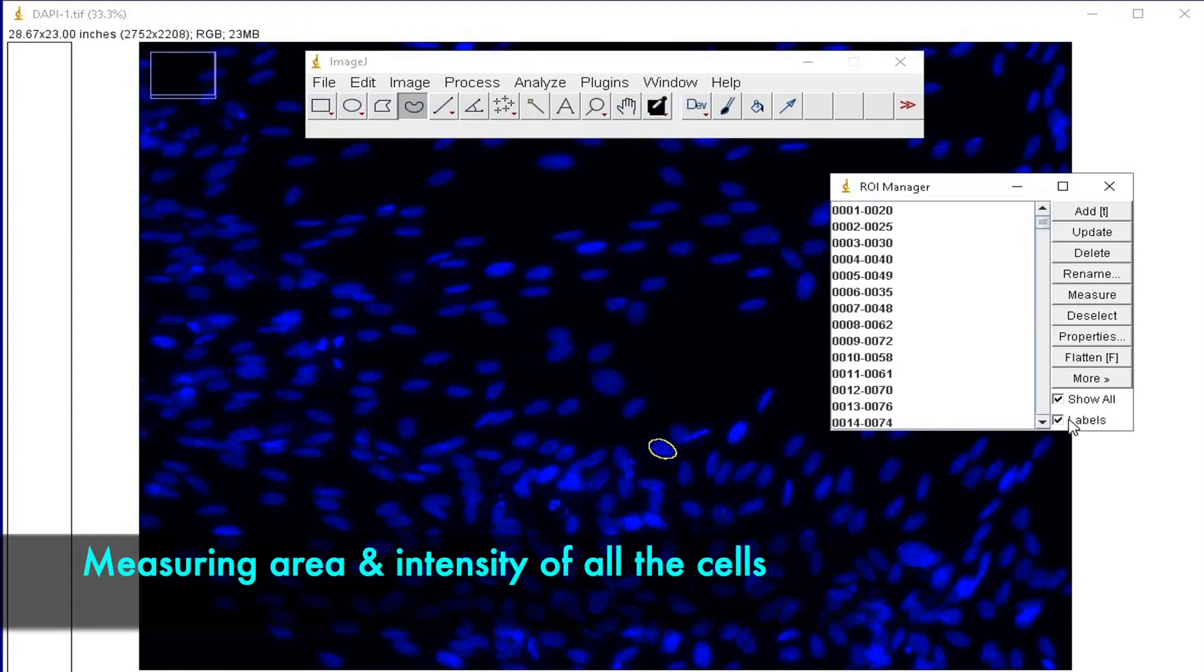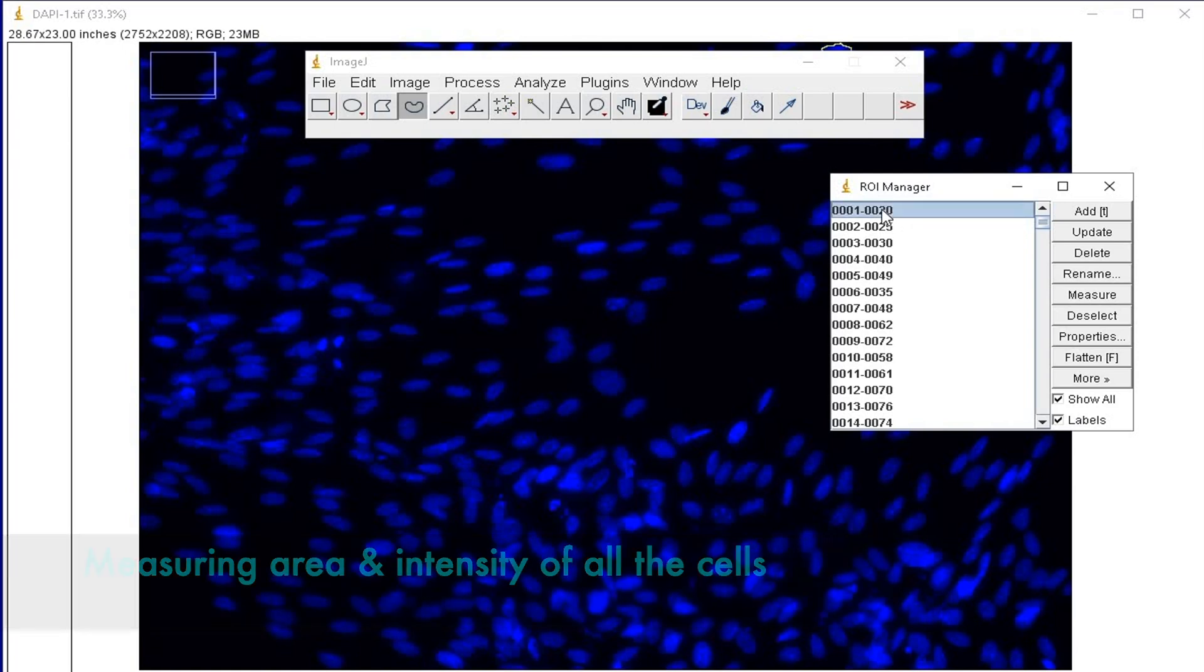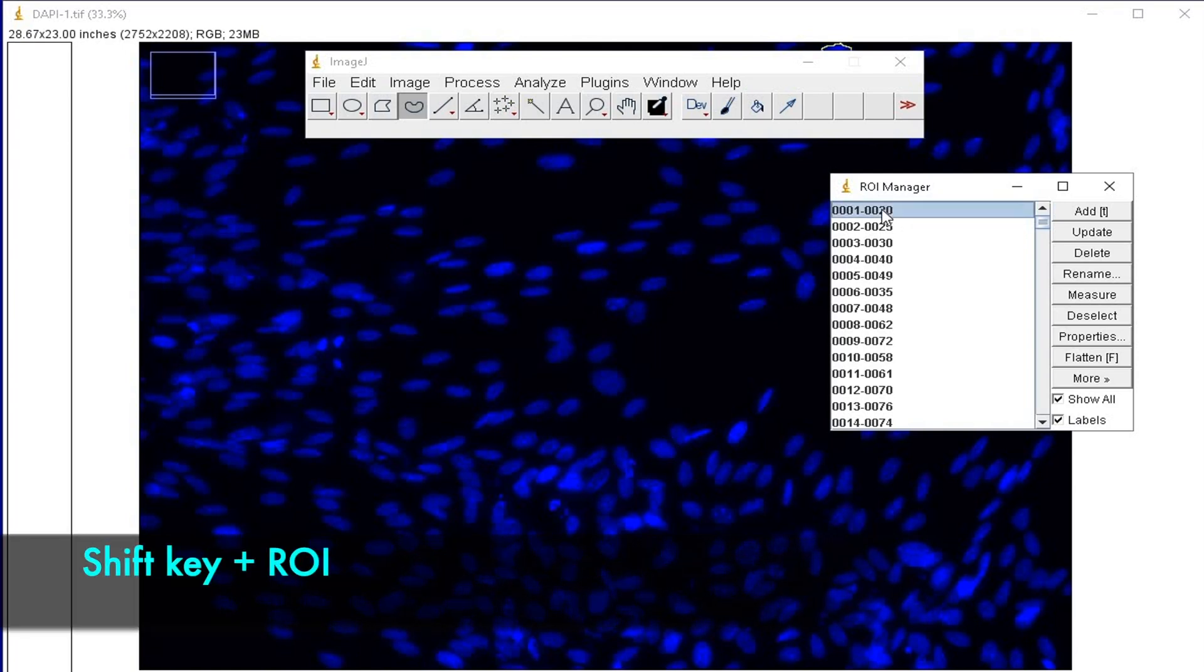To measure the area and the intensity of all the cells, hold down the Shift key and select the first ROI in the ROI manager.